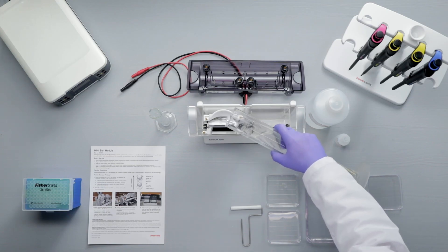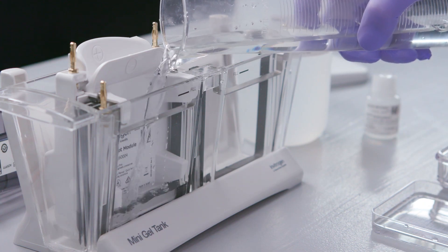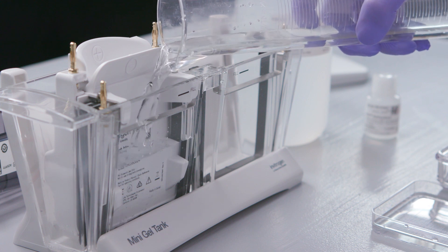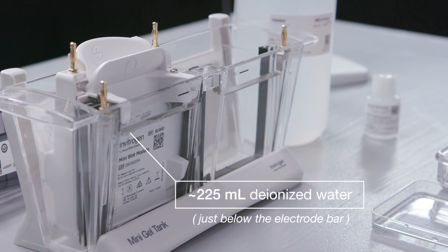Extra transfer buffer can be added to the module core to submerge the sandwich, but don't fill it above the gasket. Add transfer buffer or deionized water, about 225 milliliters, to the chamber, just below the electrode bar.